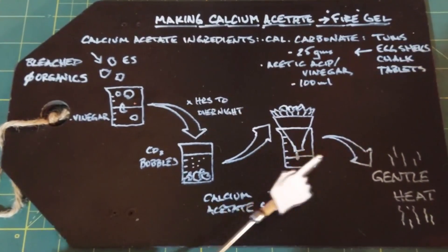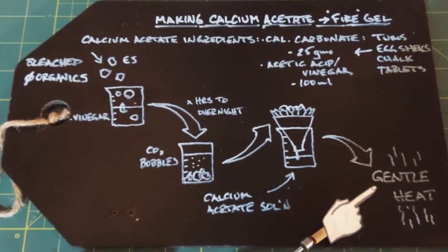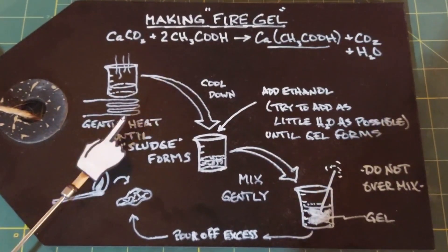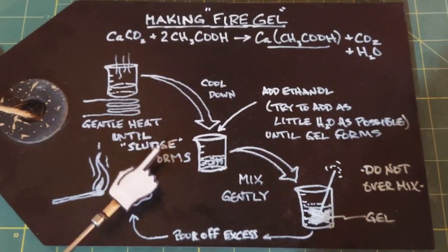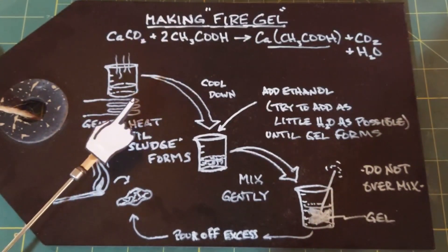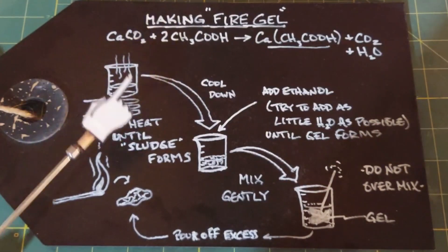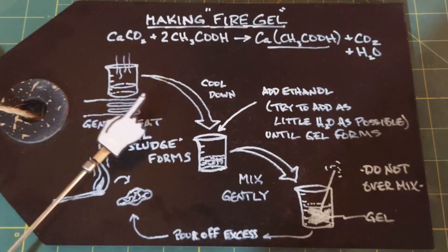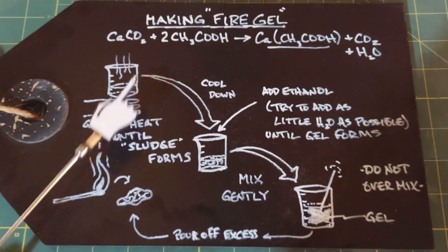You then take the collected solution and gently heat it until a sludge starts to form. Gentle heating is necessary because if you overheat it, you'll form acetone, which will evaporate out and you'll have ruined your experiment. Once you get that white sludge on the bottom, that's your calcium acetate.